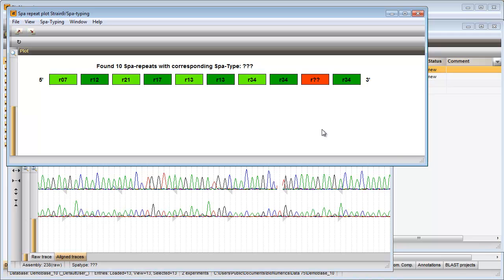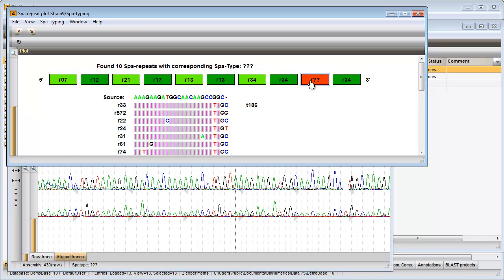When I click on the unknown repeat, a table is displayed with the editing suggestions. Replacing the gap with a D will give the repeat 33 and will result in type 186.